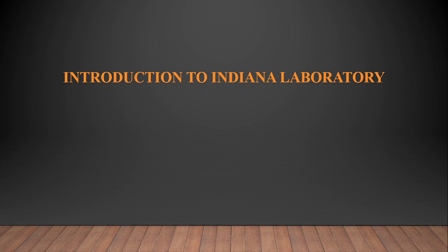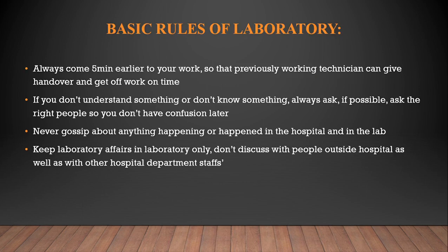So let us start today with some of the basic things for new technicians who have joined the Indiana laboratory. Today we look into the hospital information system, which is the first beginning for any newly joined technician to know how the laboratory requests are generated, how the test values are entered, and how the reports need to be printed and all.